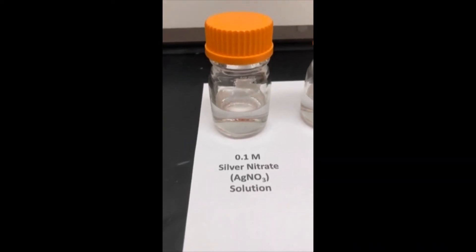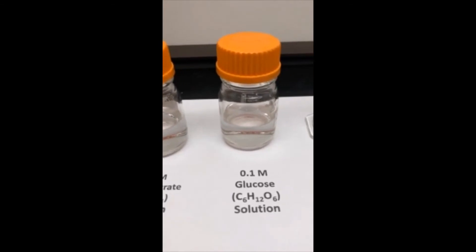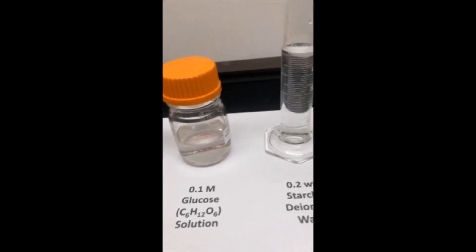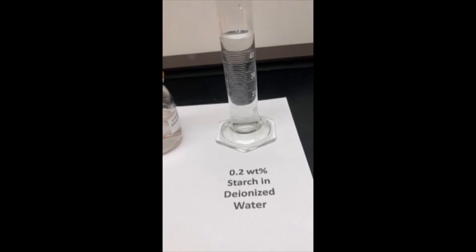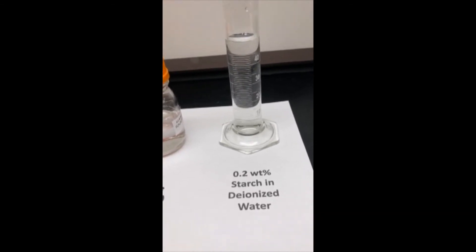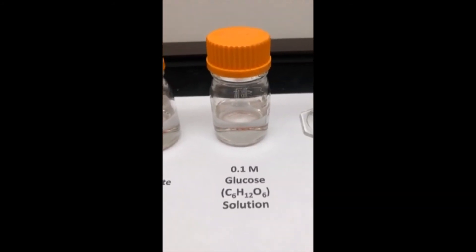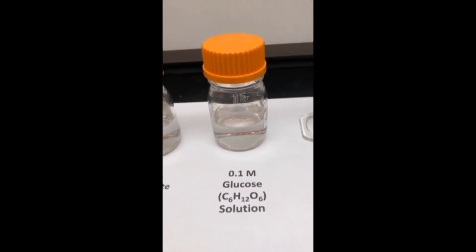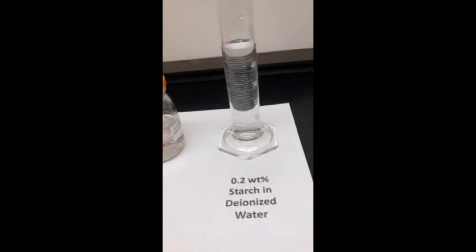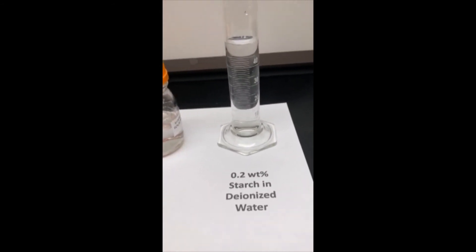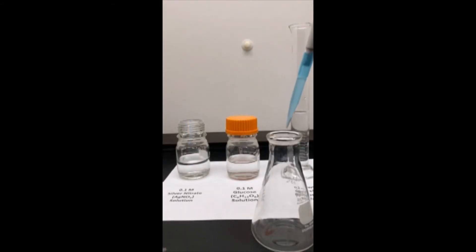There are many chemical synthesis routes to producing nanoparticles. In this case, we are fabricating silver nanoparticles using a 0.1 molar solution of silver nitrate as our silver source, a 0.1 molar glucose solution, and a 0.2 weight percent solution of starch in deionized water. The glucose reduces the silver ions in the silver nitrate solution and the starch is present to coat the silver metal as it forms to prevent the silver from agglomerating and forming large particles.